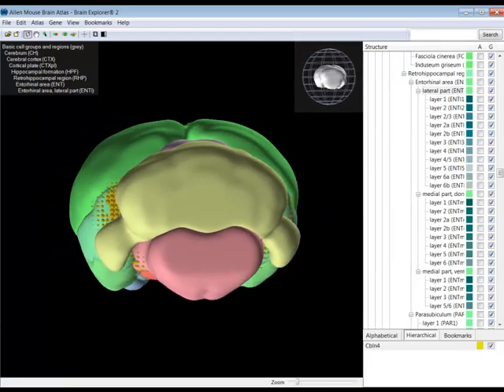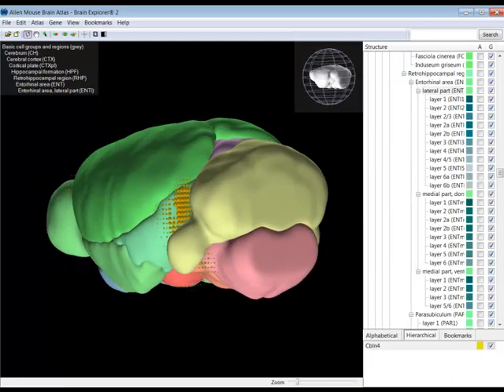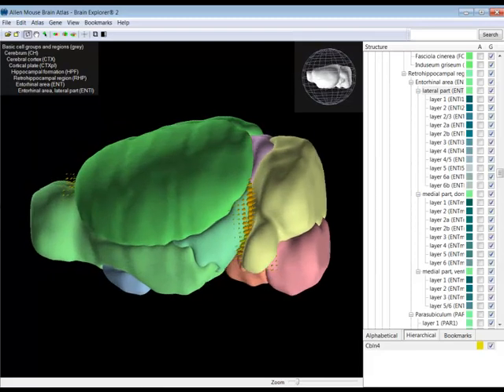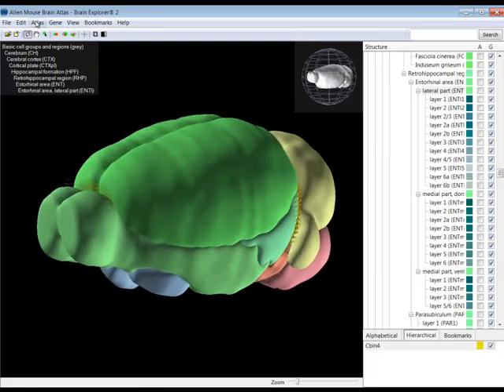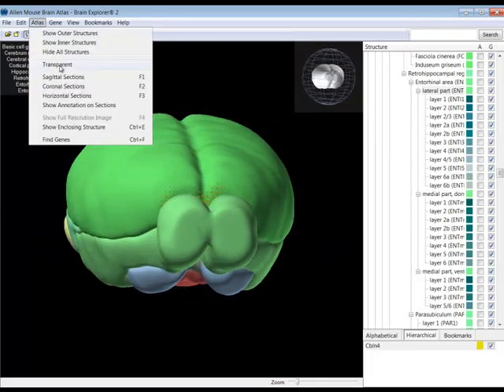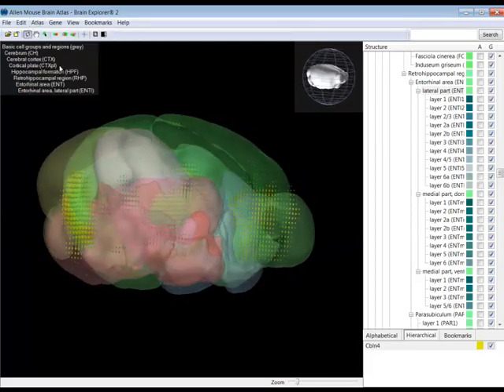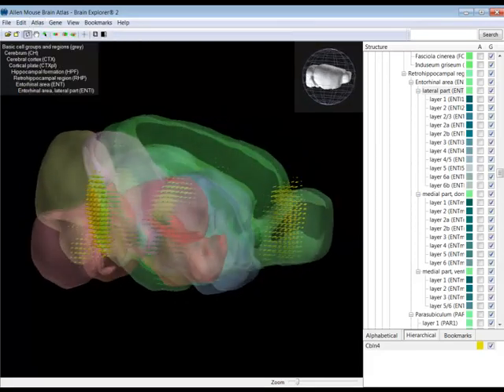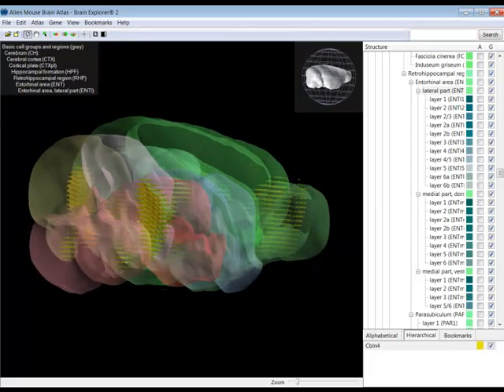You can even make those structures transparent by clicking transparent in the Atlas drop-down menu, so that you can see gene expression inside the structures.